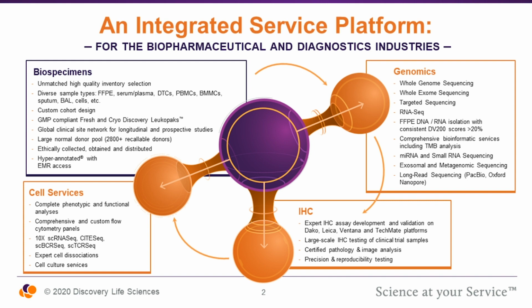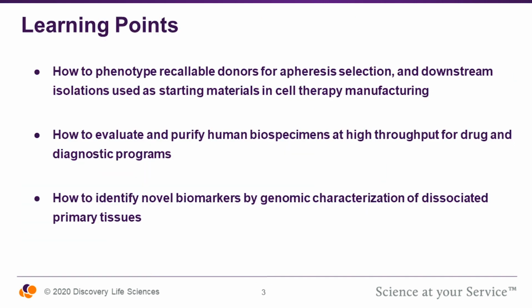Finally, we have a cell services platform. This platform deals with all assays in which a viable cell is the starting material. So this is primarily flow cytometry, although we do also offer cell culture, cell isolations, as well as 10x Genomics technologies downstream of these products.